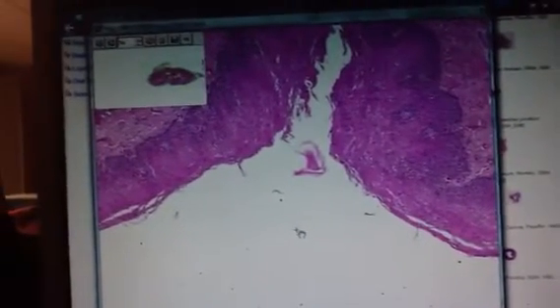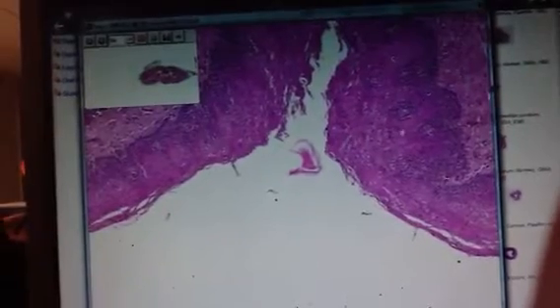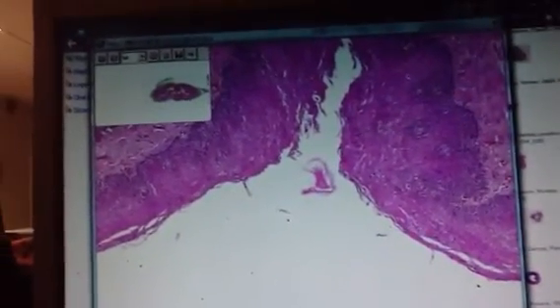I think everybody's going to say yes. Alright, so when you look at this, all this stuff stays kind of the same. I know these cells at the bottom look a little bit different, but that's okay. Even if you thought this part, it's still got to be a stratified tissue.